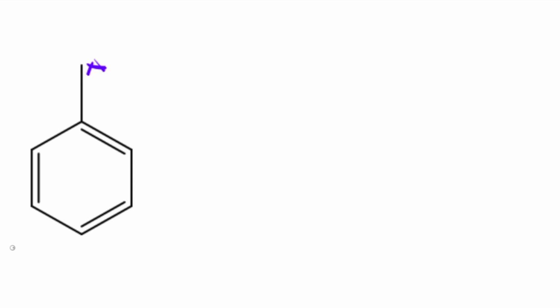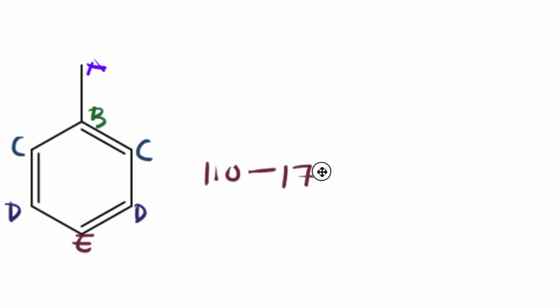integration is not a concern. Chemical shift is how you analyze and piece your molecule together. Carbons that do not have any hydrogens will show up on carbon-13 NMR. So the important takeaway is that when you see a splitting pattern of a quintet or above, it's most definitely in the middle or some point of attachment to two other atoms that have hydrogens.